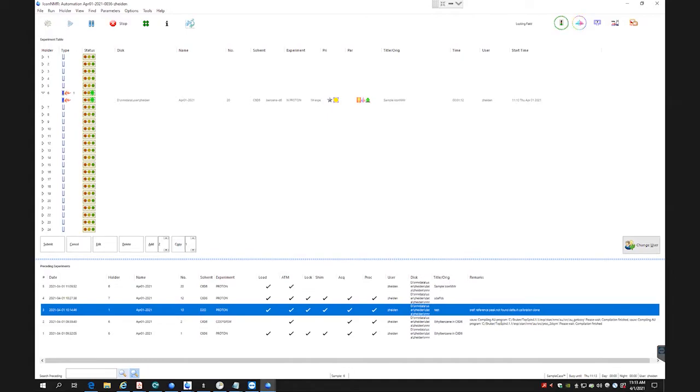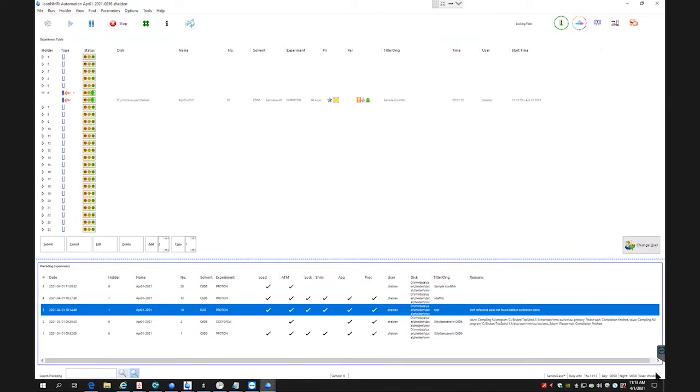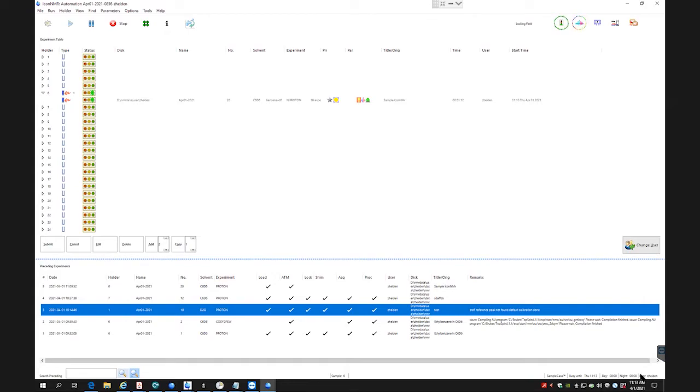And then you can see that there is nothing in the day queue and the night queue because this experiment is pretty short, it's only a minute 12 seconds. And then the current user here is hiding. So with that, you can see it's still locking. So you just have to wait for that. It usually takes a couple minutes to do some locking.